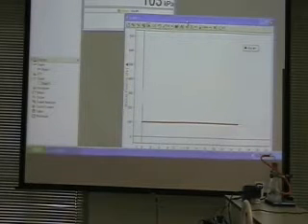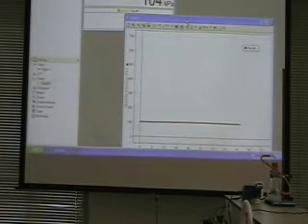Alright? Now the machine is actually taking data that's much more precise than what you're seeing there. Okay, so you're seeing 3 significant digits, 102 to 103 kilopascal, but the machine is not reading just at 102 and 103, as you'll see here in just a moment. Yeah, definitely going up because you're producing gas and it's pressurizing the thing.